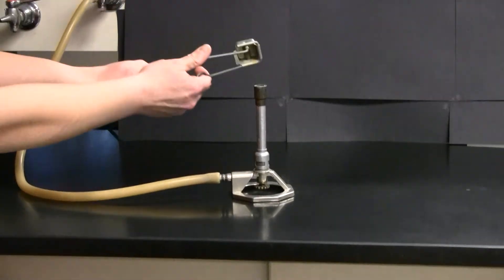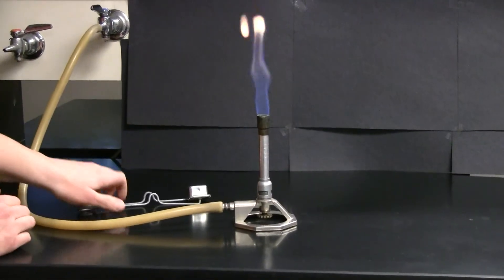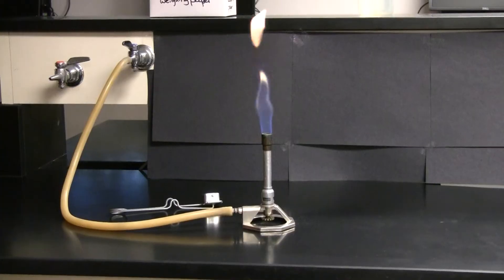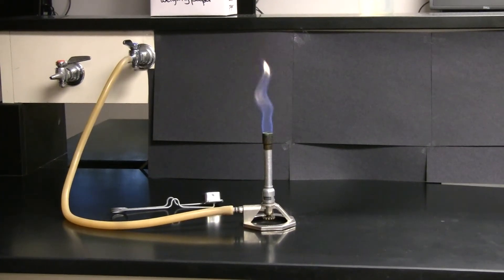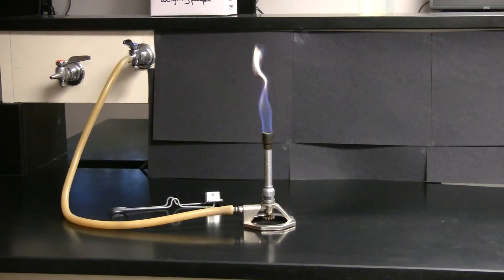Pick up the striker and light the Bunsen burner. You've now lit the Bunsen burner, but this is a very poor Bunsen burner flame. We need to adjust this flame so that we have a good strong flame that will not blow out if people are walking by.